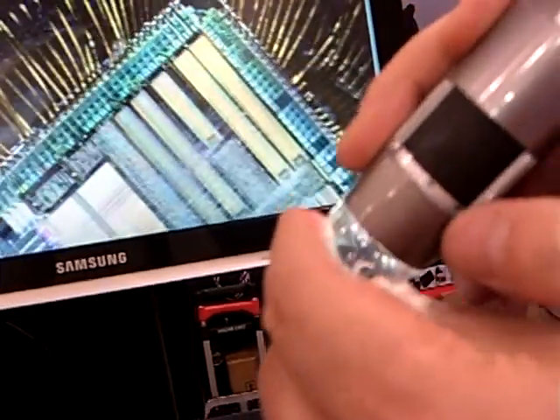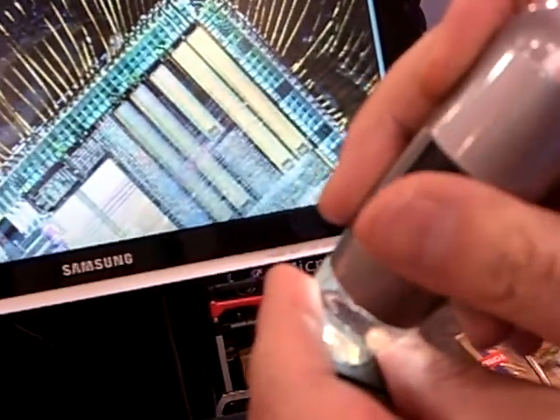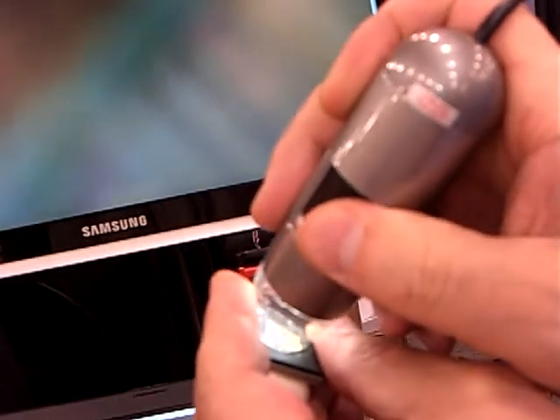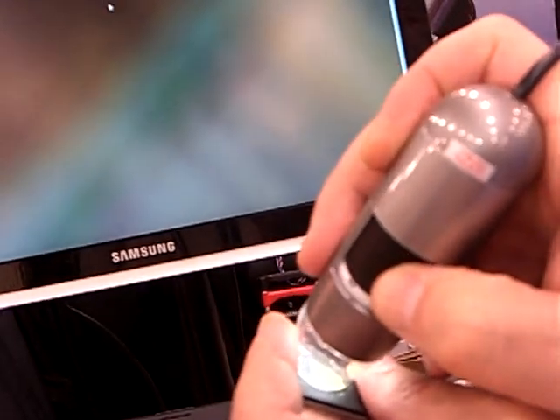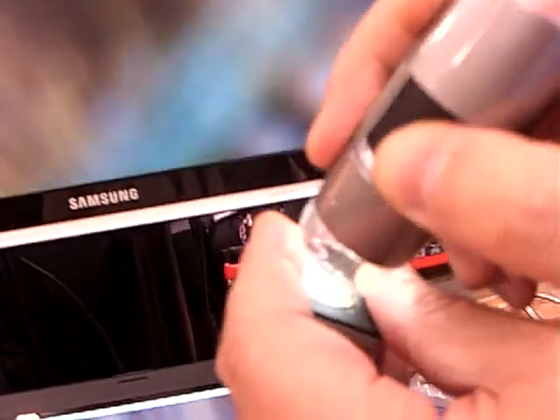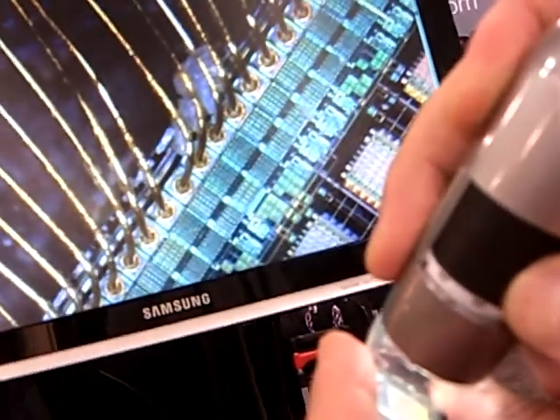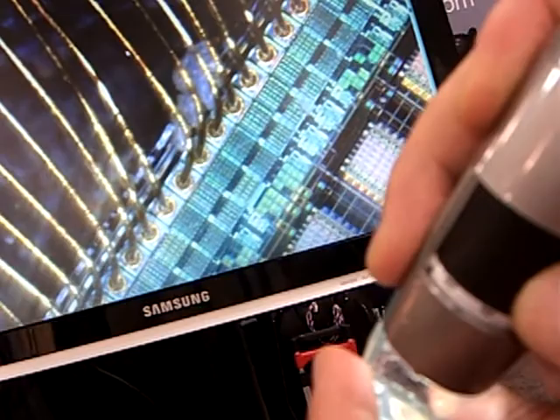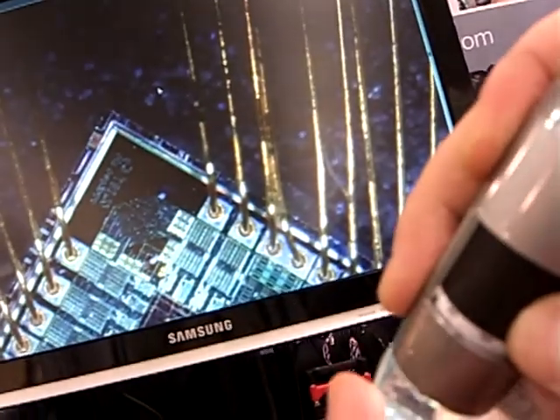This is 50x, 60x magnification. If you want more, you can continue to zoom. Right now it's about 200x.